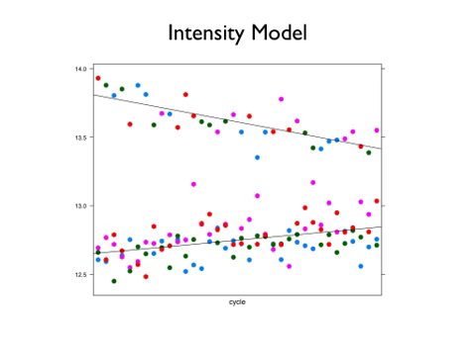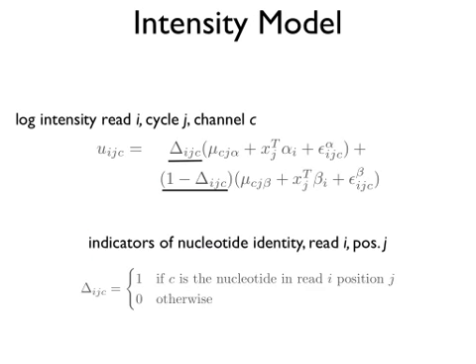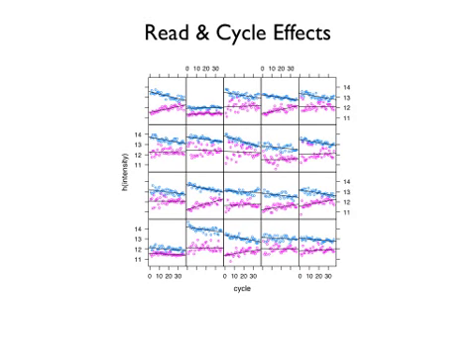So the first base is a red, whatever that is, A. The second one is a green, blue, right? So these are the bases. There's a read up there. That's the read. And this is the base, this is the background. But you can see that the line, there's a loss of signal, and there's also an increase of background. So for other cases, let me show you another picture. It's not as clean. We're going to get to this in a second, but look at the one at the bottom left. That's going to be much harder to call because the signal and the baseline are very close.